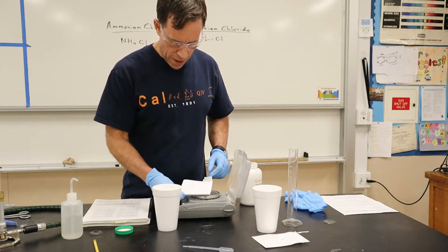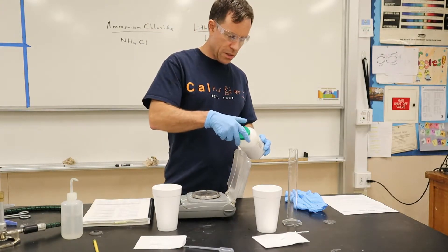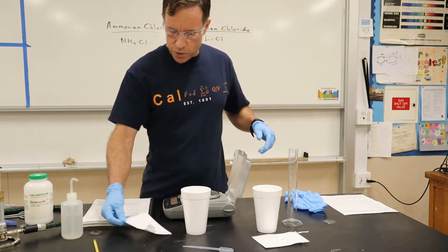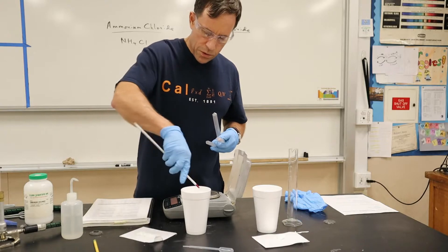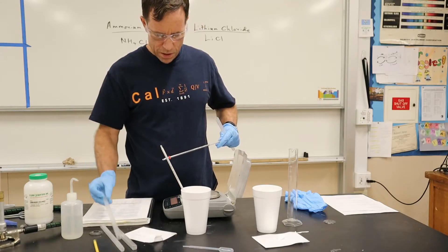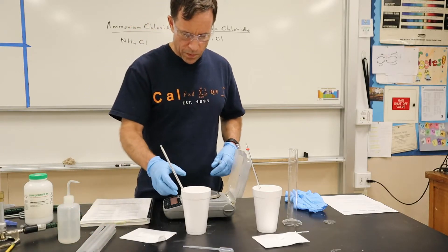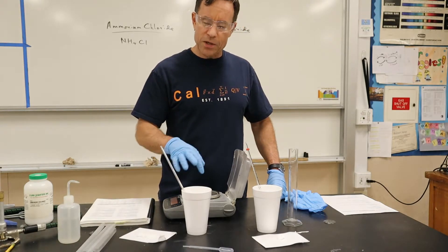This is the ammonium chloride. What I'm going to do is pour my solid into the liquid and then watch the temperature. I've got a thermometer — here's one — put it in there. And I've got another thermometer. I'll add the solid into the liquid and then we're going to see how much the temperature changes.